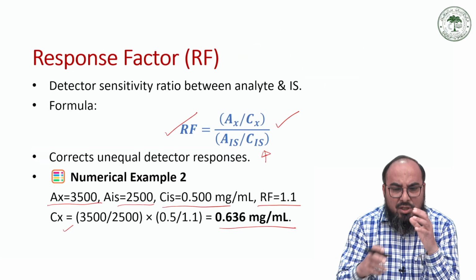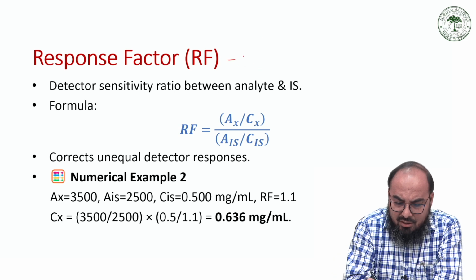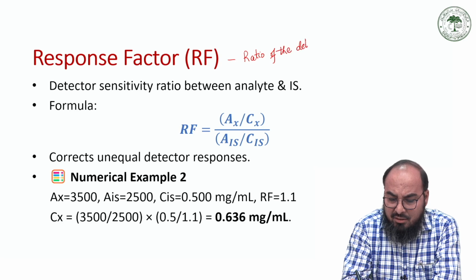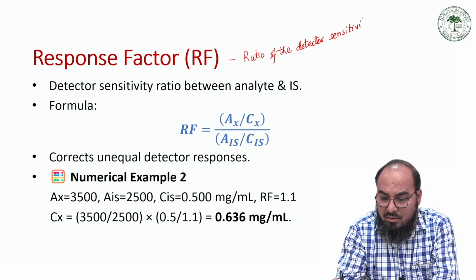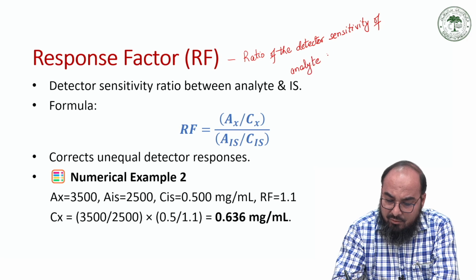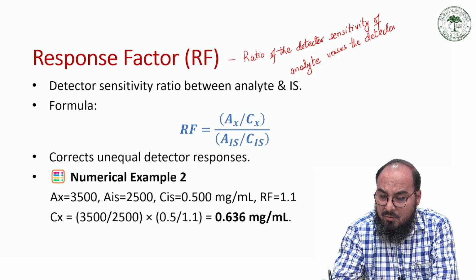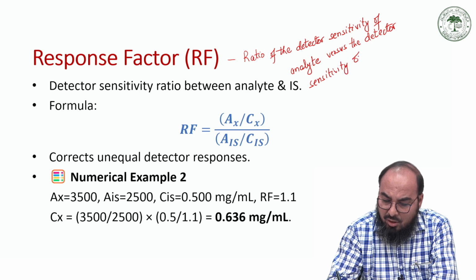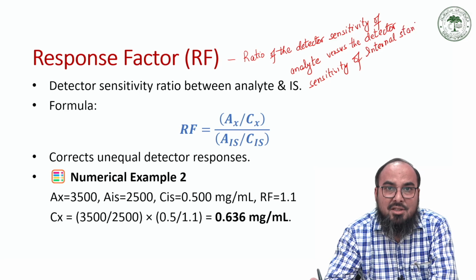Now, the response factor, actually it's a ratio. Response factor is the ratio of the detector sensitivity of analyte versus the detector sensitivity of internal standard. Okay, so this is it.